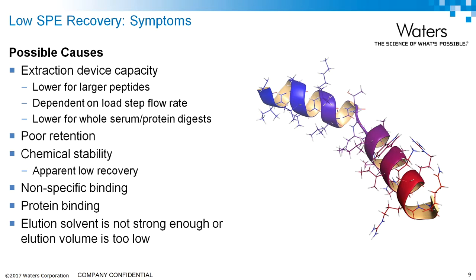One cause is that you don't have enough capacity. You may have a small device like a 10-mg cartridge with a large sample volume, in which case you might need to go to a higher capacity cartridge. It's important to note that the overall effective capacity is lower for large molecules compared to small molecules, because they cannot migrate fully into all of the chromatographic pores and are more dependent on the surface of the stationary phase for binding — and the larger the peptide, the more this appears to be true. This places a high dependence on the flow rate of the load step, where you want to maximize contact time.